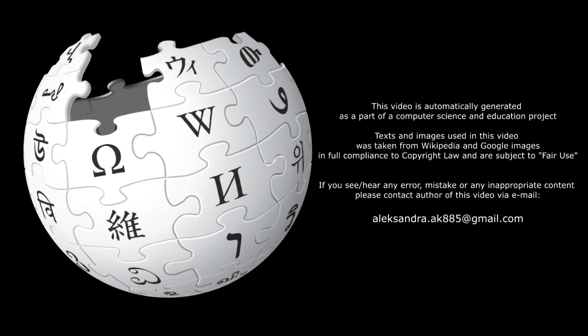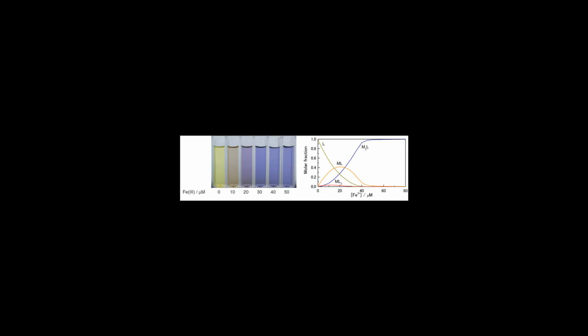Colorimetric analysis is a method of determining the concentration of a chemical element or chemical compound in a solution with the aid of a color reagent. It is applicable to both organic compounds and inorganic compounds and may be used with or without an enzymatic stage.